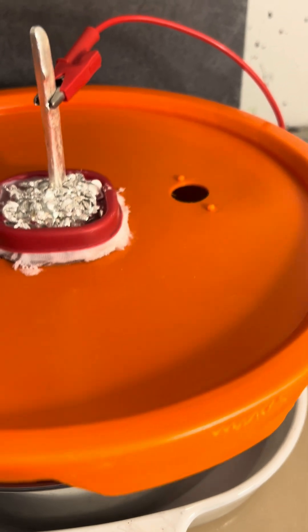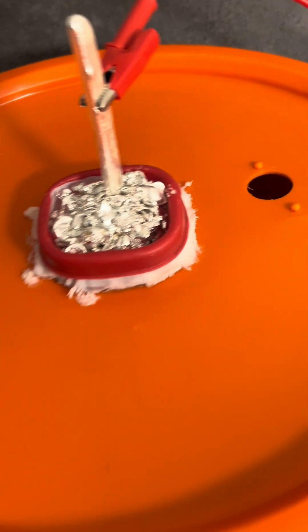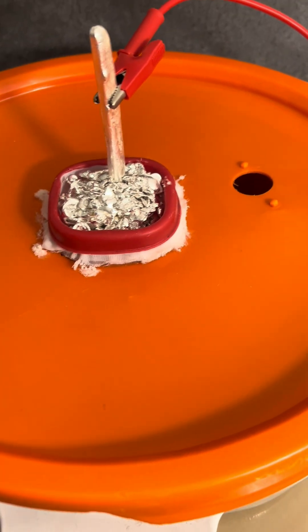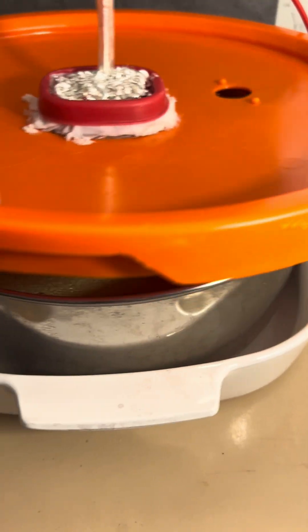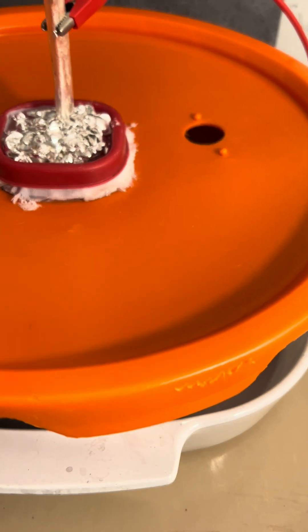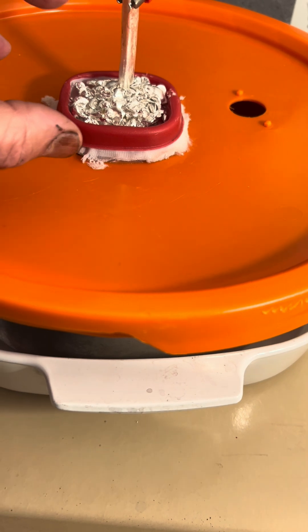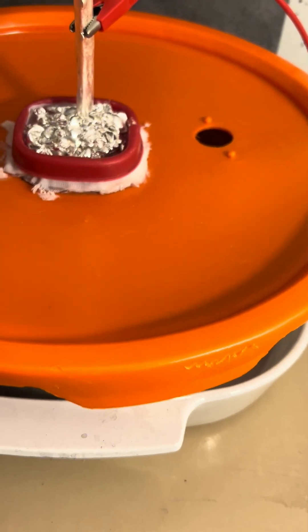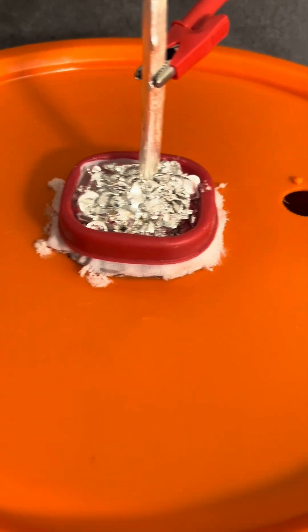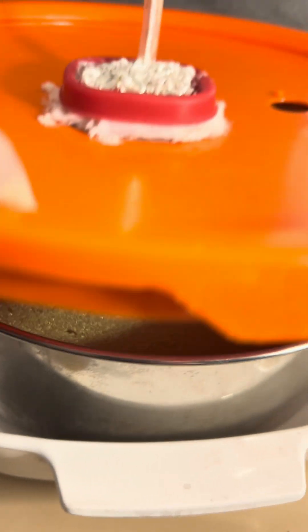There's a boundary here and a boundary here where we have ion transfer, and the nitric acid and the nitrate ion is what helps this transfer. So the anode boundary and the cathode boundary, and then we have the ions going back and forth. Those silver ions are deposited here at the cathode.